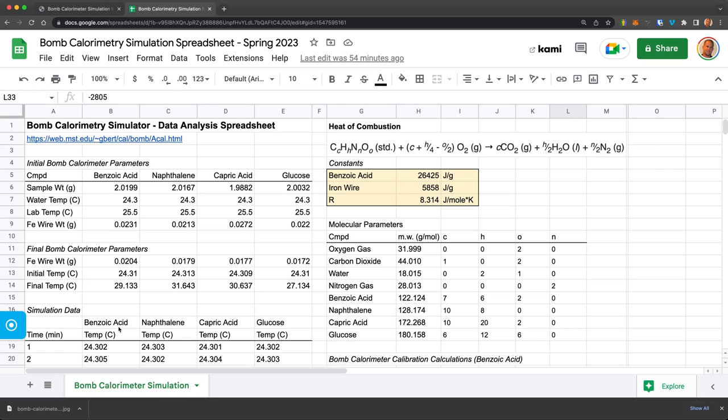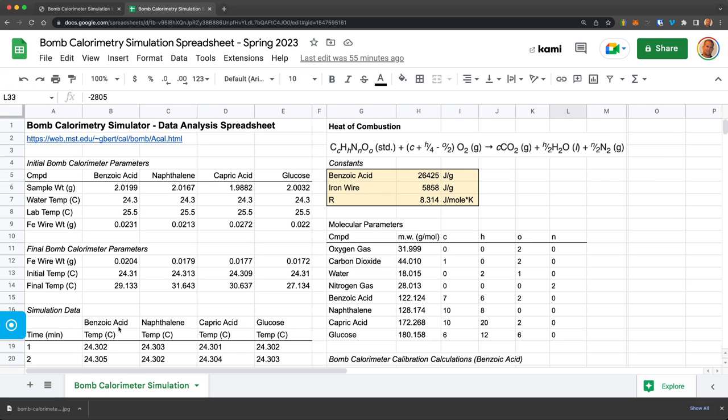Okay. I hope this video was instructive to help you get started with bomb calorimetry simulation and convince you that this is an excellent way to quickly go through and get a fairly realistic sense of the data and the process that you would do in doing laboratory bomb calorimetry experiments to measure the heat of combustion of organic materials. Thanks.